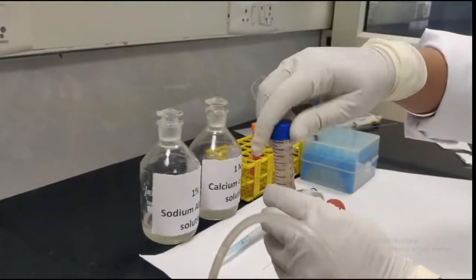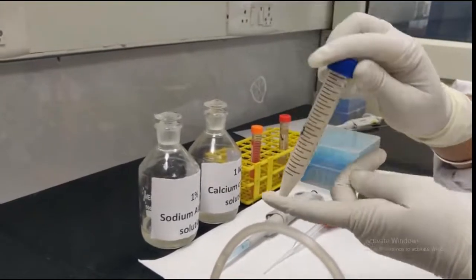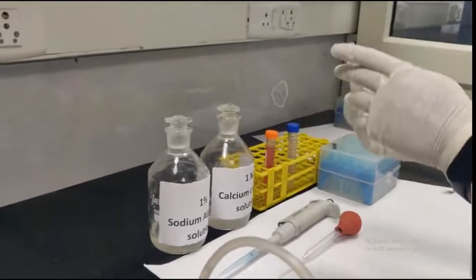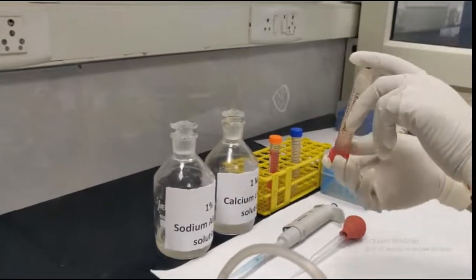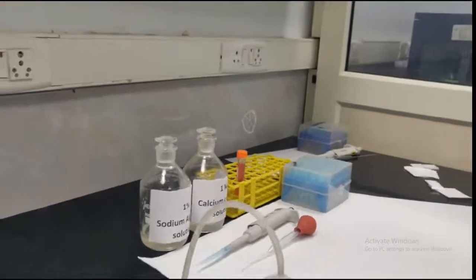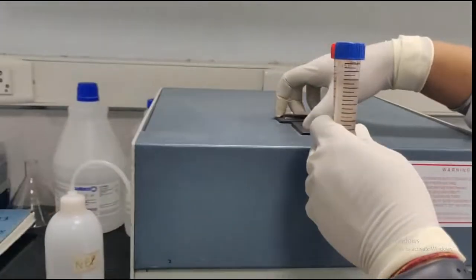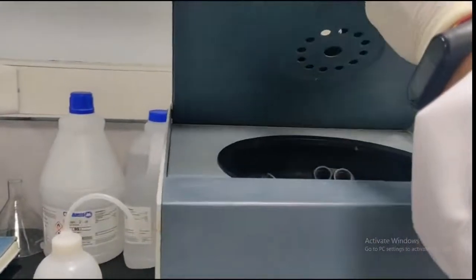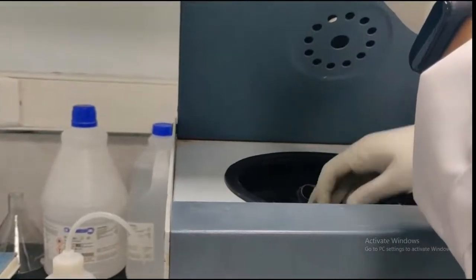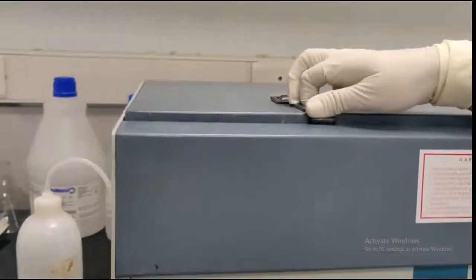Now these tubes will again go into the centrifuge, and a nice centrifugation will be done for 5 minutes. So in contrast to the thrombin clot method, we will do this washing only once in this sodium alginate technique. So now it will go into the centrifuge, and same speed centrifugation, 3000 revolutions per minute for 5 minutes will be done.